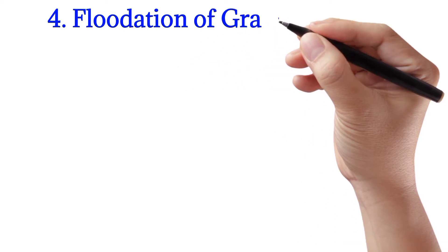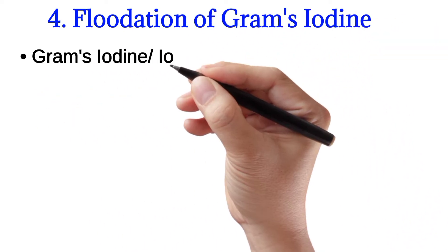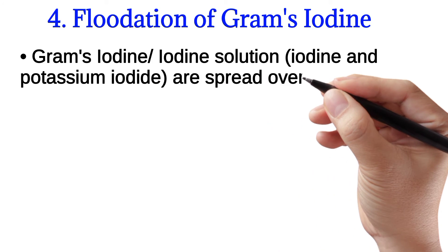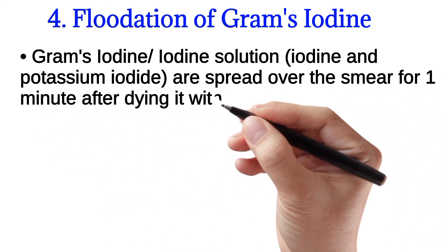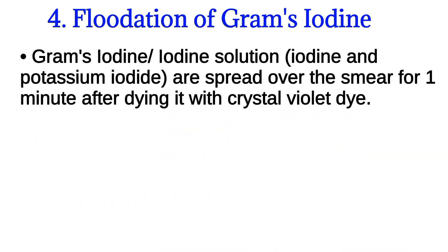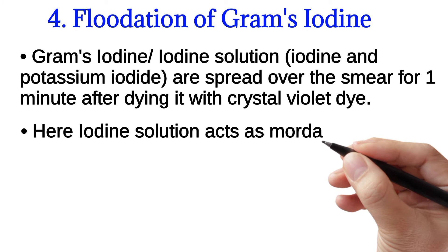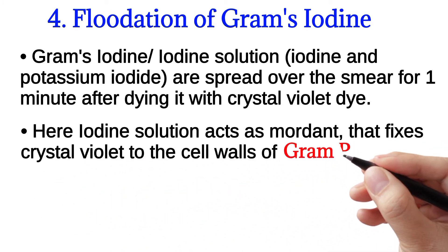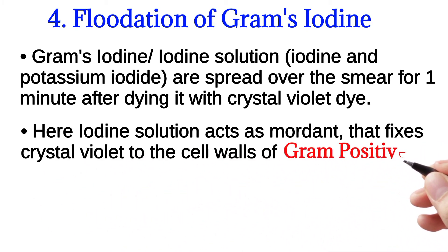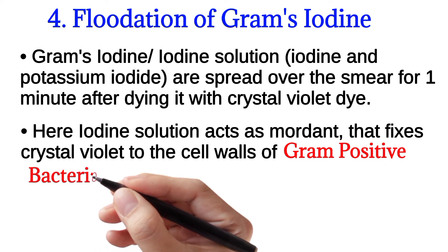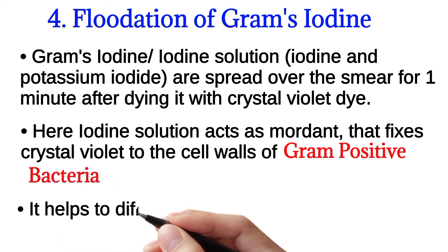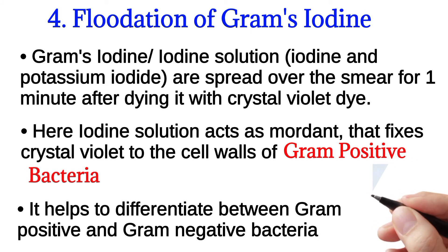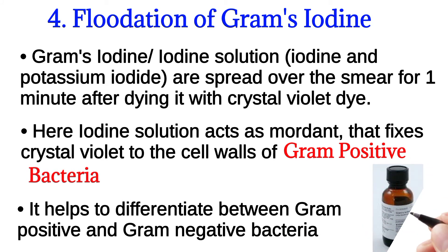Application of Gram's iodine. Gram's iodine solution is spread over the smear for one minute after dyeing it with crystal violet. Here, iodine solution acts as a mordant that fixes crystal violet to the cell walls of the Gram positive bacteria. It helps to differentiate between Gram positive and Gram negative bacteria. Here is the solution of Gram's iodine.